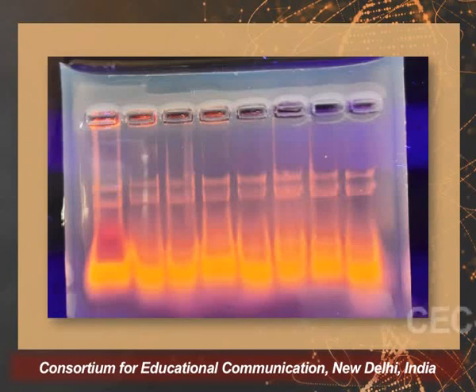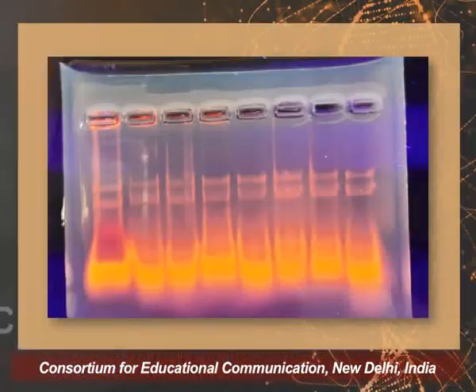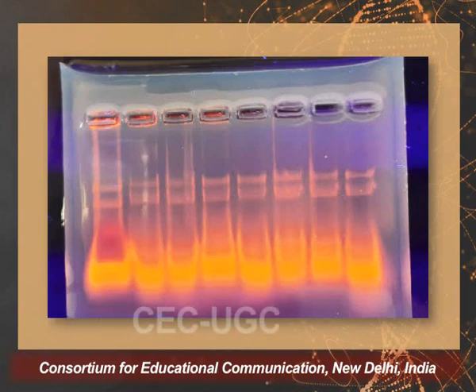So, this is a plasmid DNA isolation preparation, and in plasmid DNA you obtain 2 to 3 bands, because there are different conformations of the plasmid DNA present inside a cell. This is a total intact plasmid isolation from E. coli. You can see the RNA smear. It was a crude method, so the RNA smear has taken up a lot of stain, but it will eventually lose it. And there are 2 plasmid DNA molecules here.